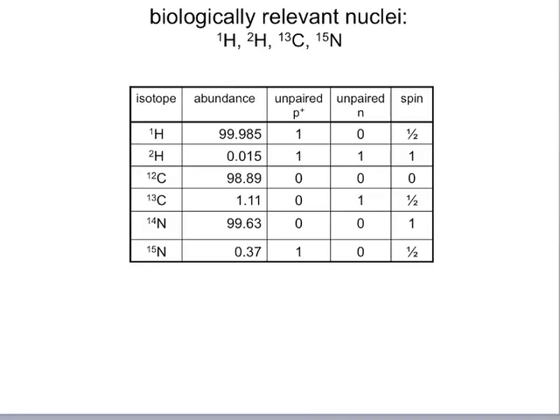a defined medium in which we provide as a carbon source sugar that's all labeled with carbon 13, or as a nitrogen source ammonium that's isotopically enriched for nitrogen 15, and no other food sources for the organism. So every carbon atom and every nitrogen atom that they incorporate comes from our labeled sugar and ammonium. So that's how we can introduce our labeled isotopes, and this in no significant way affects the structure of the molecule itself.